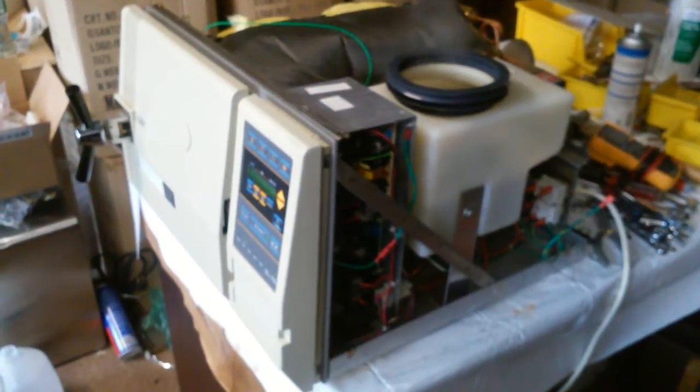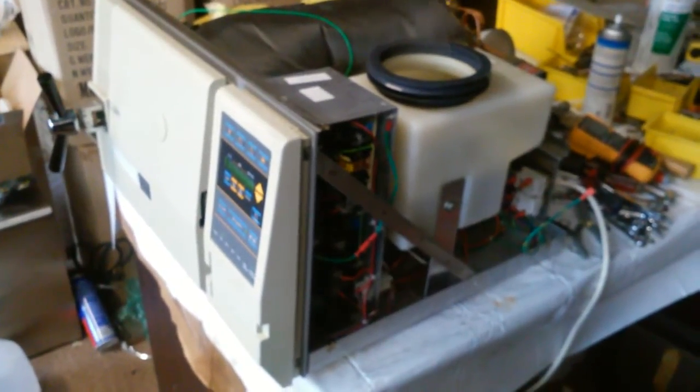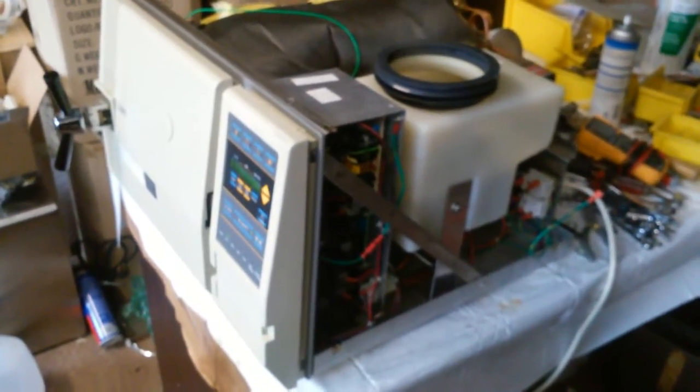This video shows you how to repair Tudna E, EA, and EZ sterilizers. Tudna does have EZ products in the market too, but there are still a lot of Tudna E, EA, and EZ sterilizers out there.